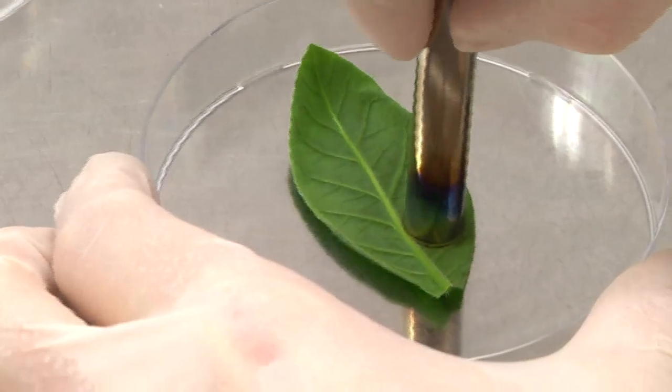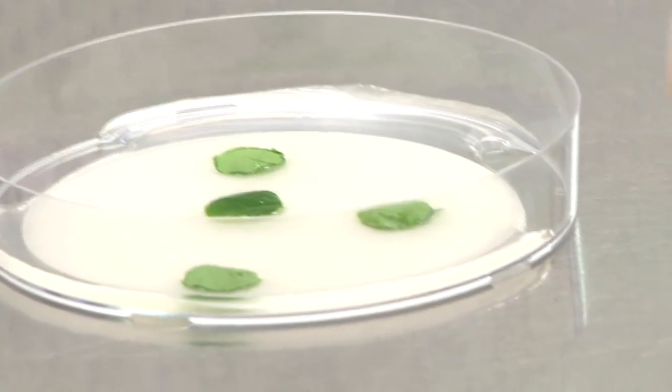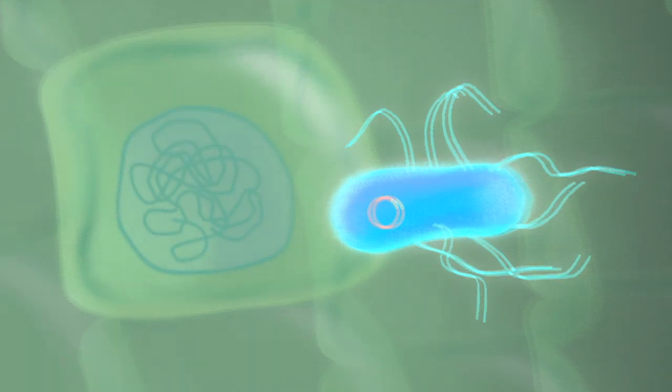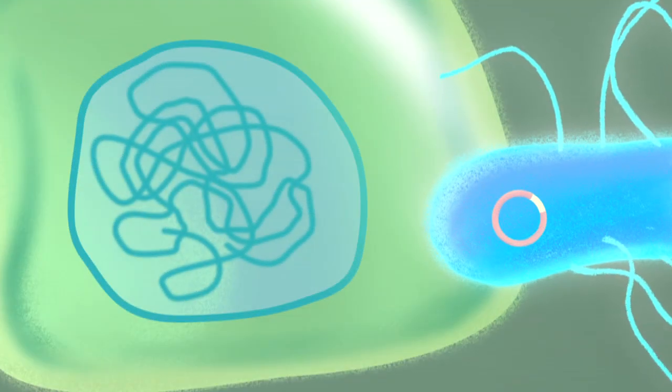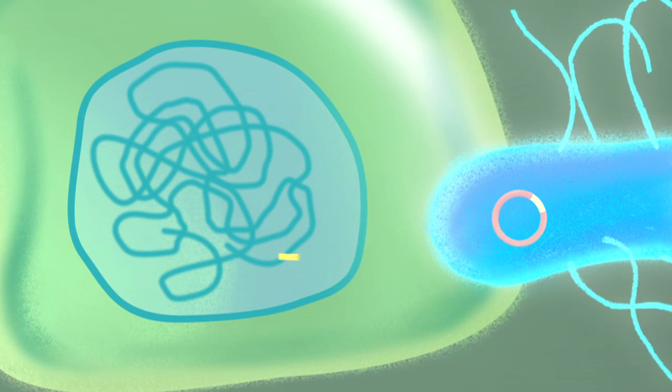And here comes the final step, where the bacteria transfer their genes to the plant cells. Exactly. In order for this to happen, we'll punch out leaf discs from the tobacco leaves. We'll then place them on these filter papers, which are soaked with our bacteria suspension. The punching leaves cells on the edges of the leaf discs wounded, and that's where the agrobacteria will enter the plant cells. Afterwards, we'll place the leaf discs on a culture medium. Here, the transfer of DNA from the agrobacterium to the plant cell will take place, and the leaf discs will be genetically transformed.